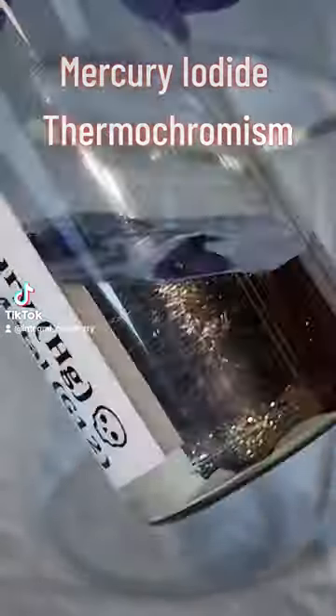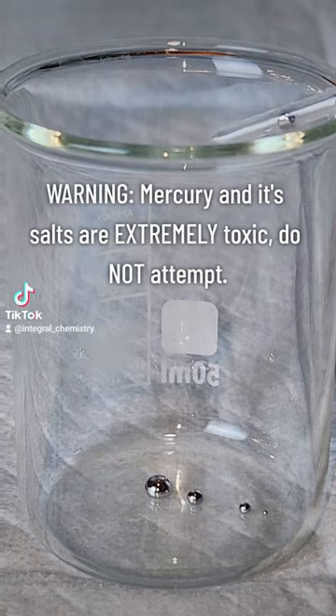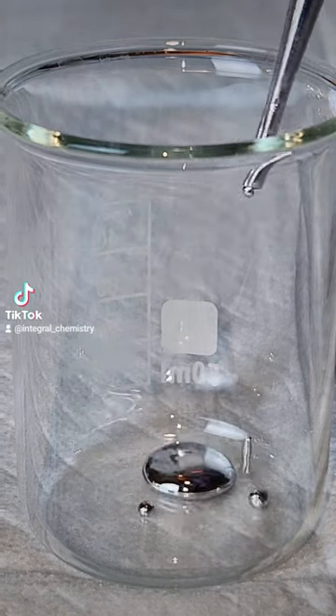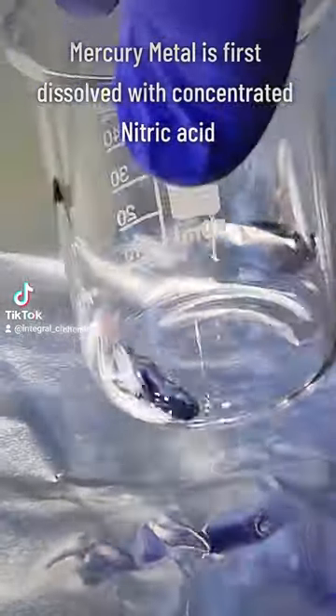Today I'm going to synthesize the beautiful but extremely lethal chemical mercury iodide. I want to strongly warn against anybody attempting this experiment, as mercury and its salts are extremely toxic and a powerful environmental pollutant.